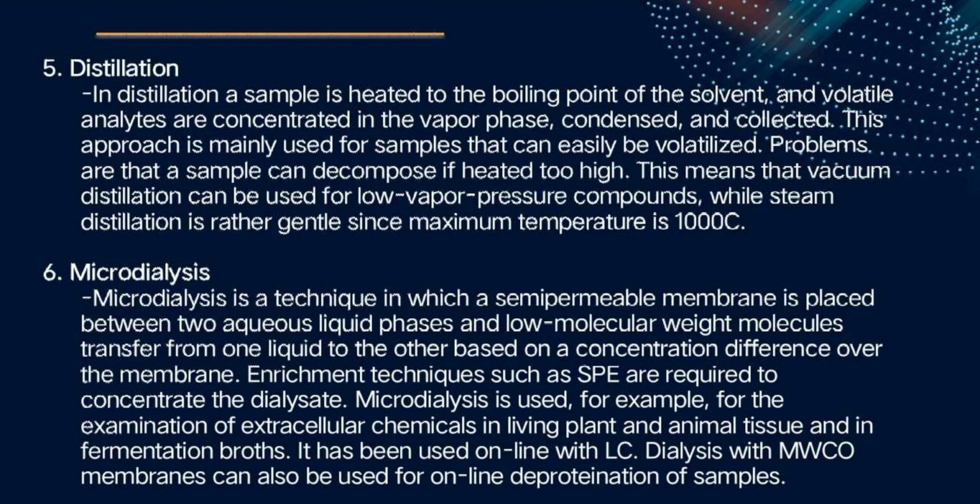Microdialysis is used, for example, for the examination of extracellular chemicals in living plants and animal tissues and in fermentation broths. It has been used online with LC. Dialysis with MWCO membranes can also be used for online deproteination of samples.